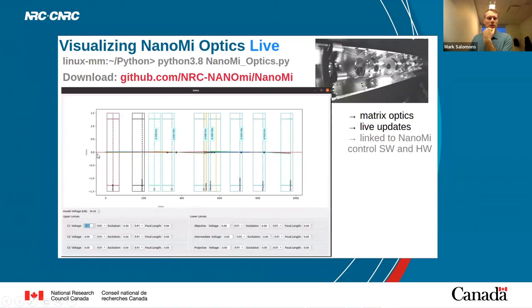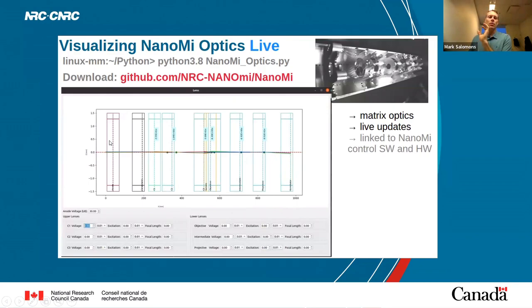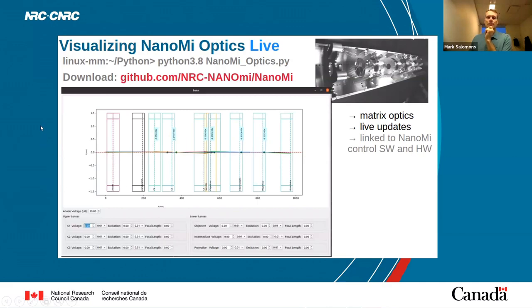In conjunction with the control software, we've also done software just for visualizing the beam. We can place our different components and do a live simulation of what the beam should look like. This is very helpful because sometimes when people use a TEM it's a big black box and they don't really know what's going on inside — this tool helps you visualize and understand the physics behind it.